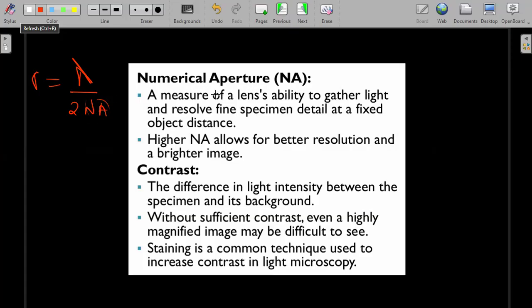Then you also have other terminologies like contrast. What do you understand in your own words? What is contrast? The difference between two things. Okay, so when you are trying to differentiate two things, that's contrast, isn't it? Yeah, so that's a simple term for contrast.